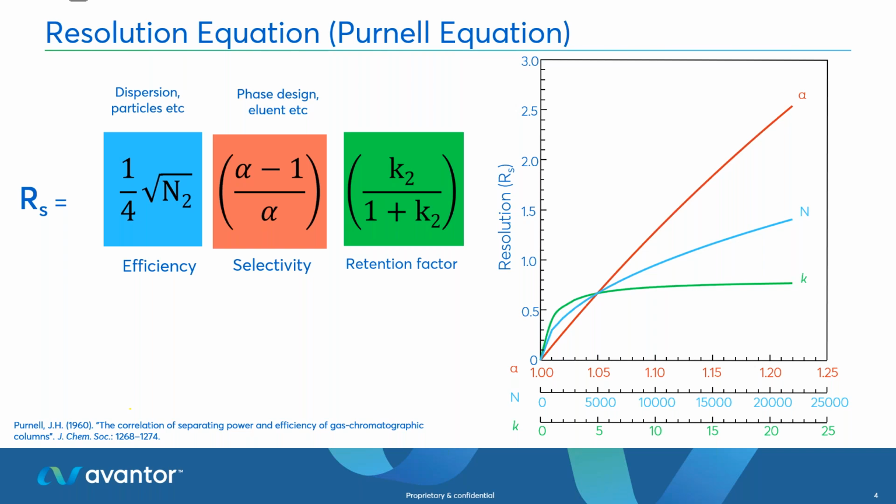So how does that fit with resolution? Here we have another equation. I'm going to go through it quite simply and practically to show you what this means in real life. So resolution, as I've said, is what we normally need to report out in our methods.